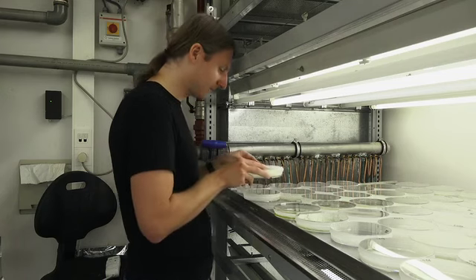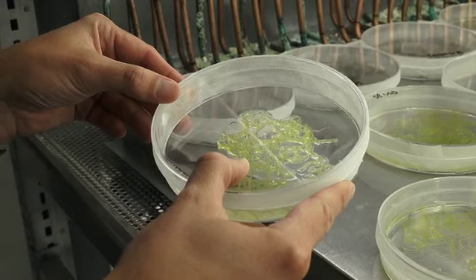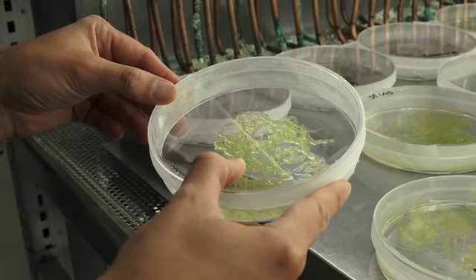So then you really need to consider carefully, can I use, for example, Cas9? Do I need to go for a Cas12? Is it better to use a base editor? So all these things you have to take into consideration at that point. Sometimes you make a construct and it's simply not functional. So Cas proteins use a specific RNA molecule to recognize a DNA target.